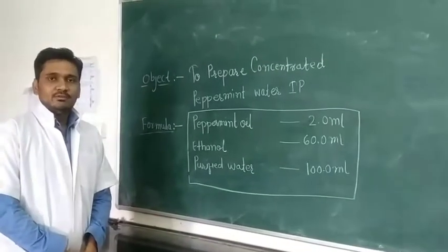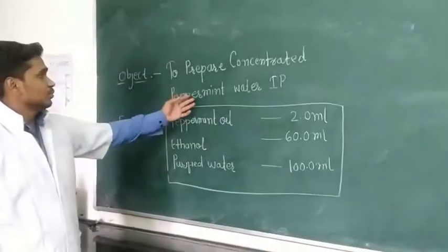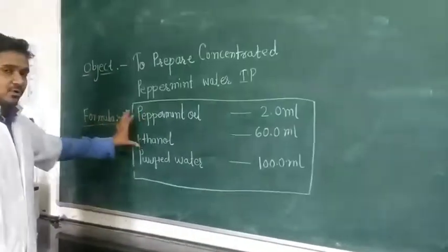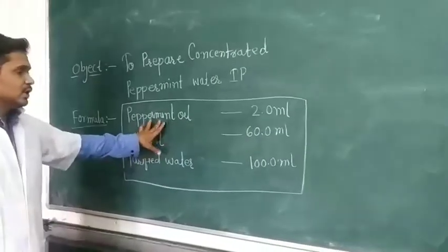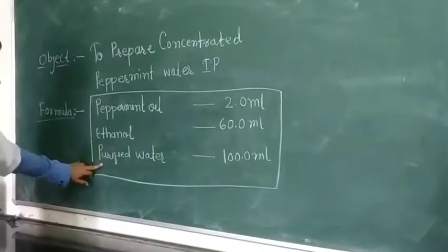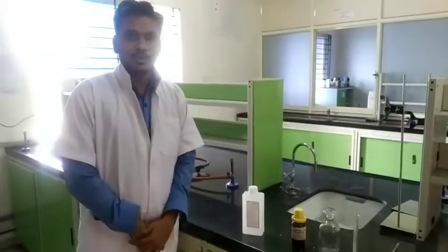Welcome all. Today we are doing our next practical of Diploma Pharmacy, and our object is to prepare concentrated peppermint water IP. Our given formula is peppermint oil 2 ml, ethanol 60 ml, and purified water sufficient enough to produce 100 ml. Let's see the requirements.